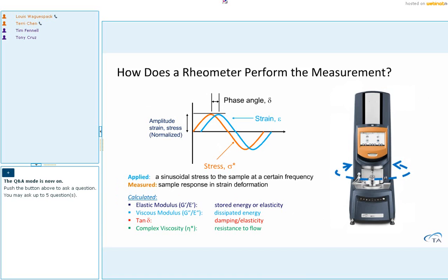The most commonly used rheological experiment for thermoset analysis is conducted under oscillatory mode. In an oscillatory test, the instrument applies a sinusoidal stress to the sample and measures the sample's response. If this oscillatory amplitude is small enough and does not irreversibly break the structure of the sample, the responding sample signal should also be in a sinusoidal waveform.